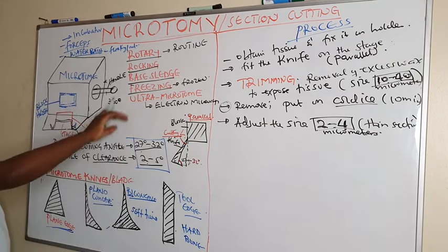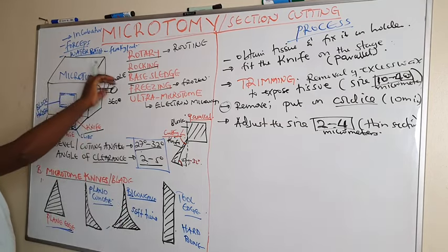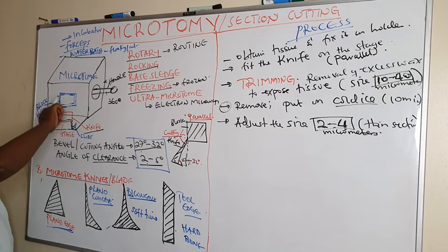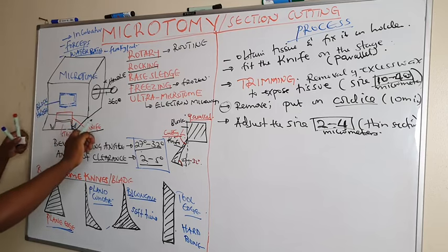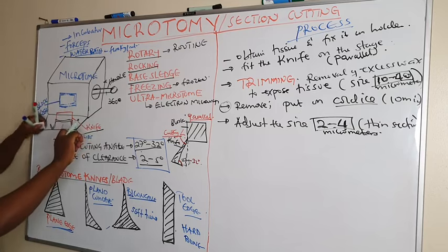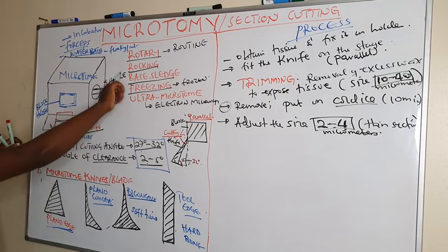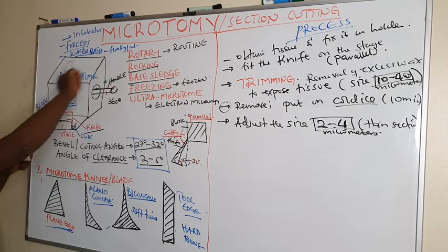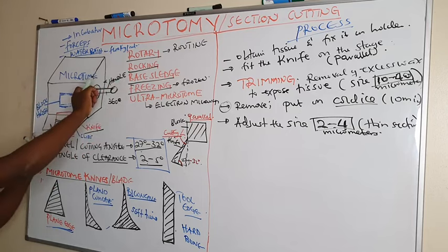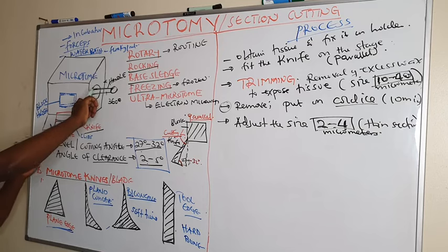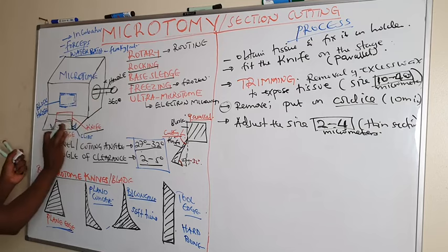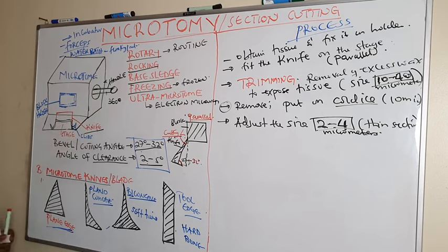Use your right hand to hold the handle, and the left hand holding the forceps. As you are cutting the sections, keep holding the ribbons using the forceps to avoid them accumulating on the stage.